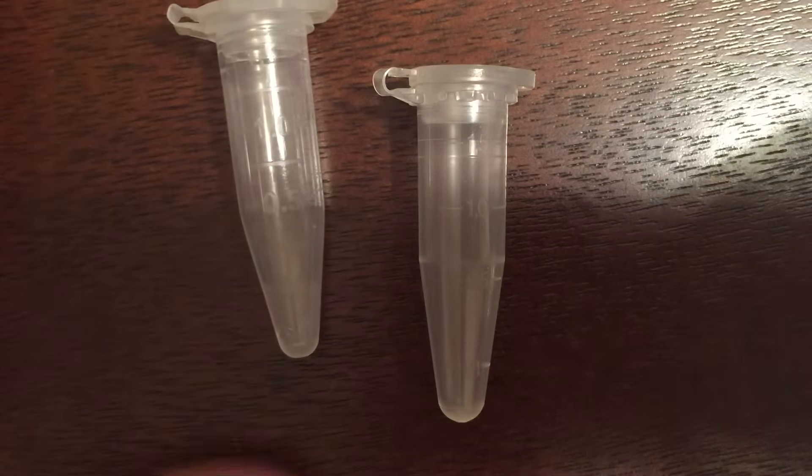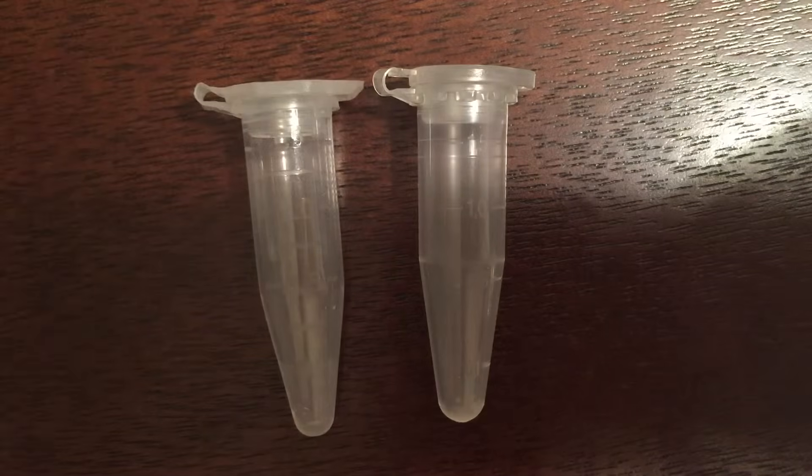Despite the similarity in profile and appearance, there are some advantages to the Brandtek tube. That 1.7 milliliter tube provides some extra room if you have a liquid that is going to be at or approaching 1.5 milliliters.